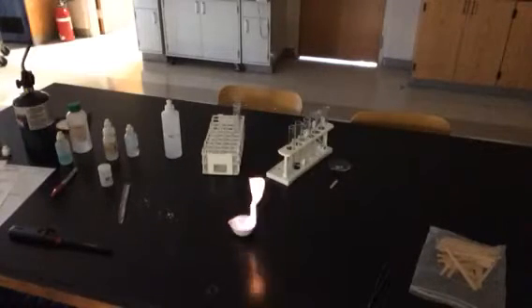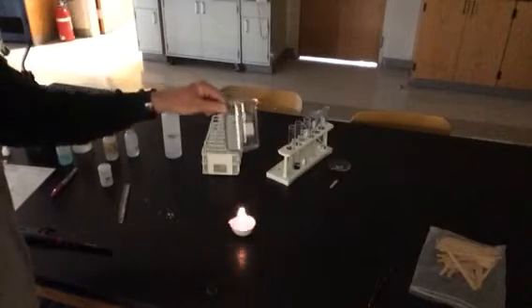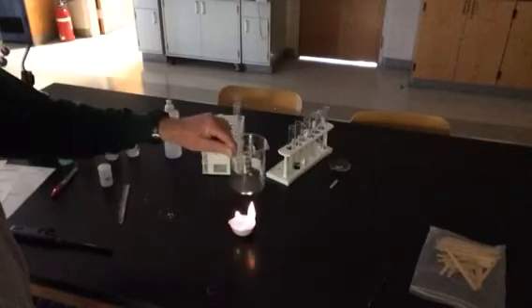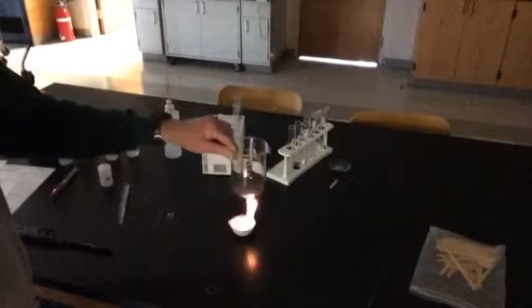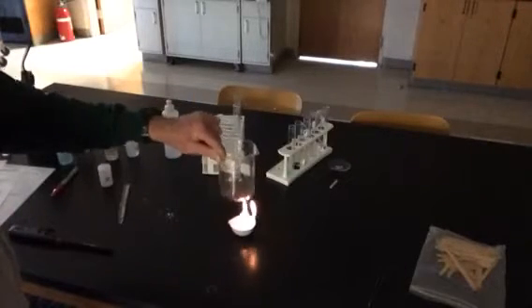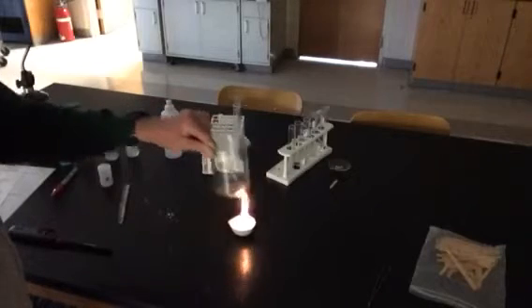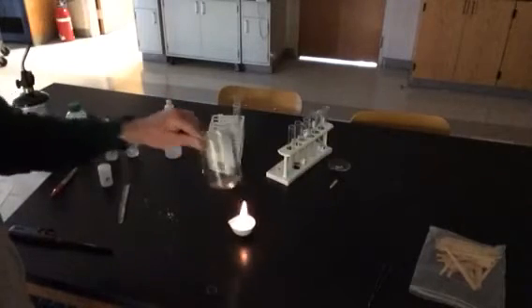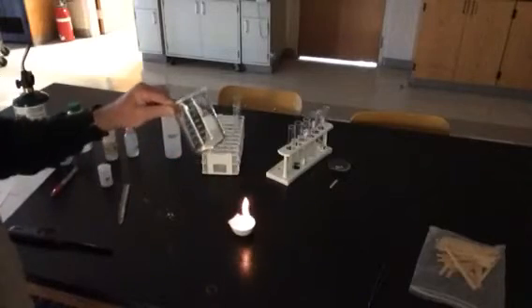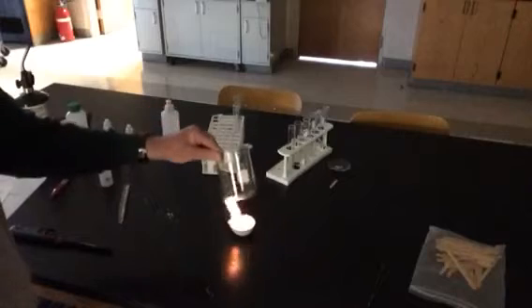So one of the things I'm going to do is hold a beaker, just an empty beaker, above the flame for a few seconds probably. And we'll see if we get evidence of another product here. Sometimes it's kind of hard to see the products. Okay, for sure I know I've got some heat being produced.